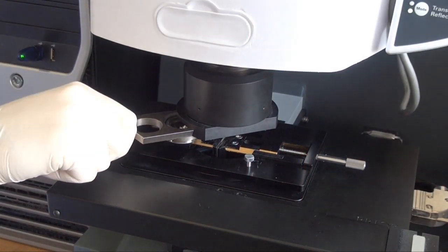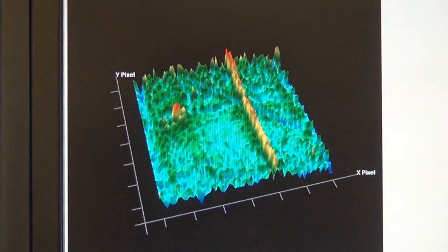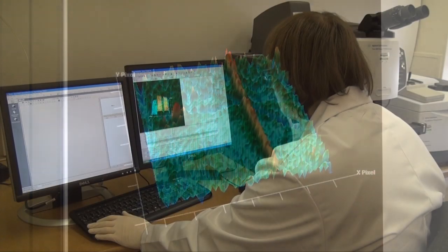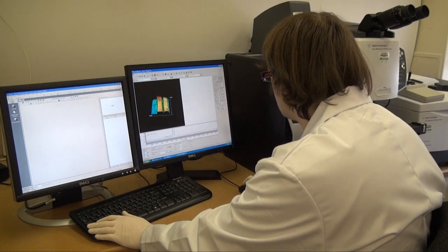The microscope then generates a chemical map of the cross section, which is seen here as a 3D image. The different colors represent different layers of the plastic laminate. The infrared spectrum of each layer can then be compared with library spectra to make an identification.